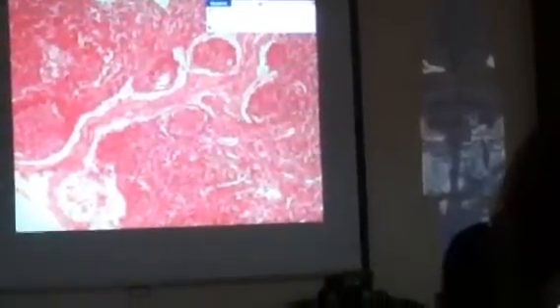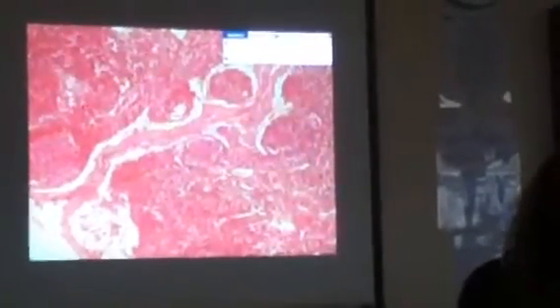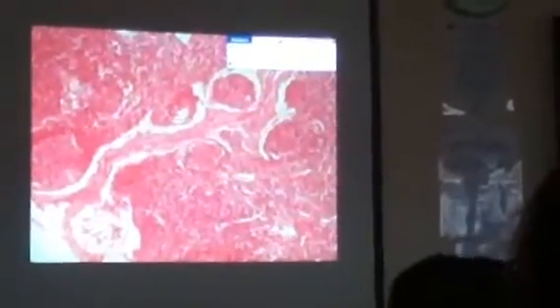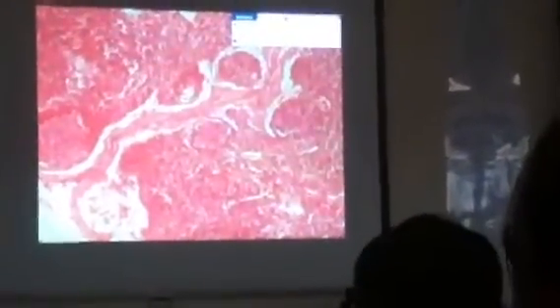Pangalan sa naka-outline ng mga structures. Naka-point ng mga structures. Okay, lymphoid nodes, follicles. How about that portion? Pointed. Subcapsular. Okay, those are the structures which you should be familiar with in this slide. Capsular.